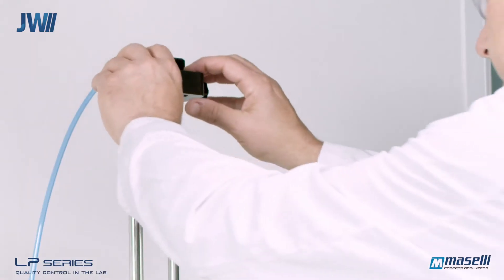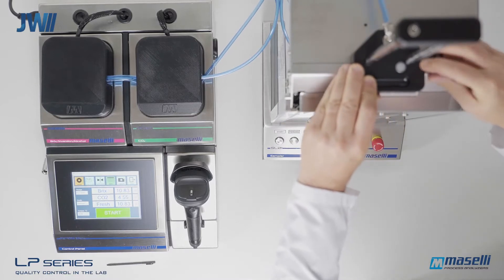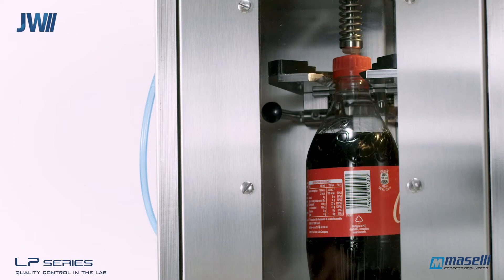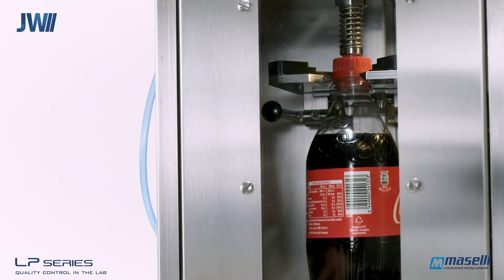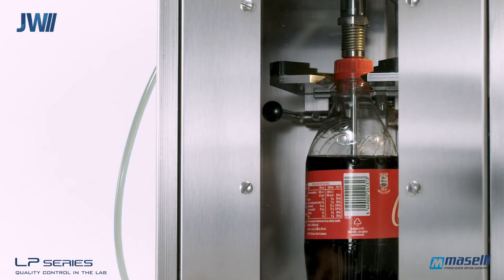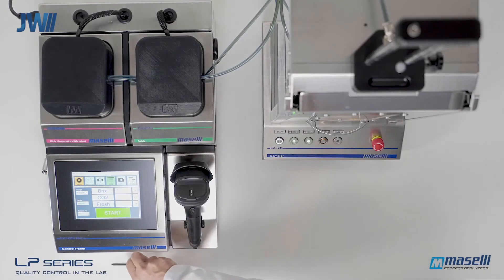Indications are provided to show the sampler status. The operator then lowers the sample needle into the liquid. Here we can see the sampler pierce the container. Sampling of the beverage is automatically initiated and the product sample is taken to the analysis modules under pressure. The analysis is initiated by pressing start on the touchscreen display, or this can also be configured to automatically start.